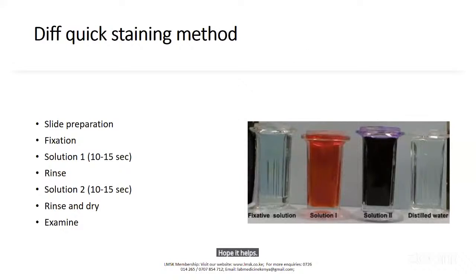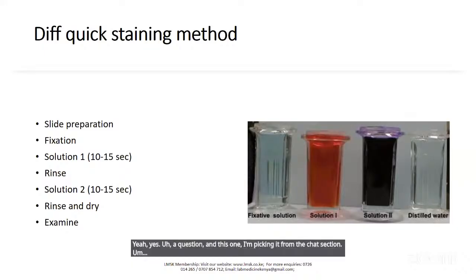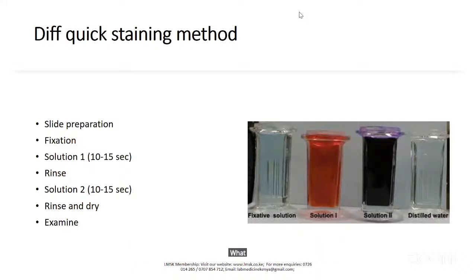Yes, a question, and this one I'm picking from the chat section. George Luquiso asked, what advises the choice between doing the touch prints versus frozen sections? Yeah, I got it.